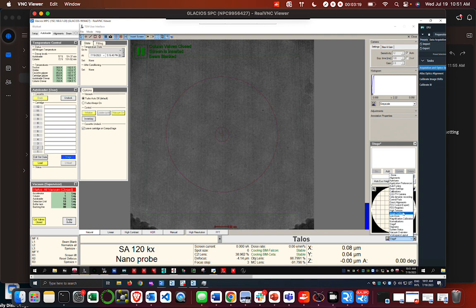And usually you don't really need to use that much. Usually I just default to having this set to stage squared. But there are instances as a new user where you may want to adjust the alignments or the apertures from this section. But just know that they're there, and then you'll be able to be more independent and work.